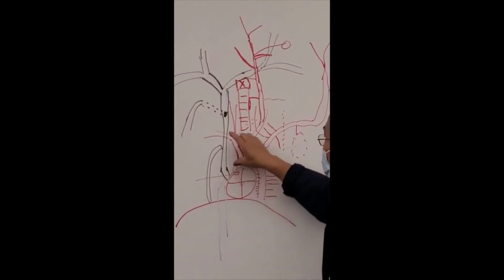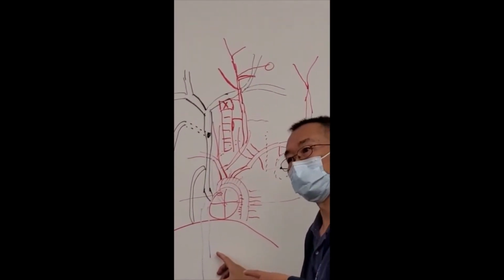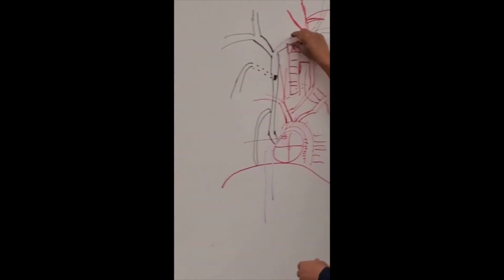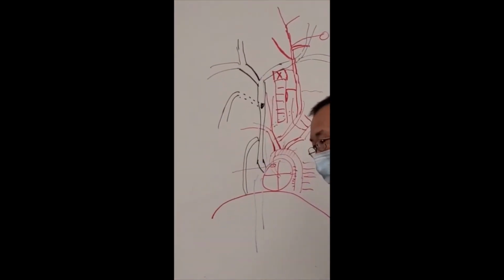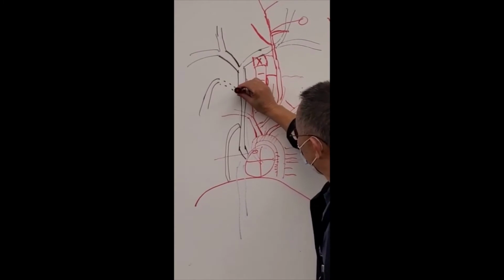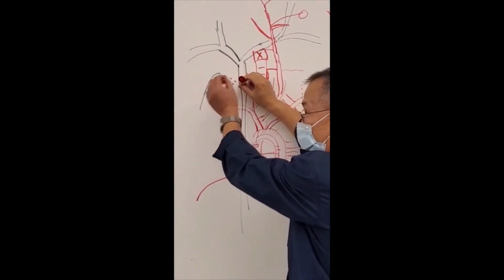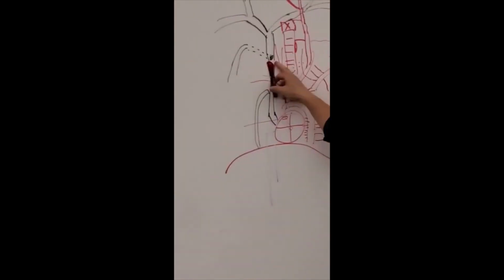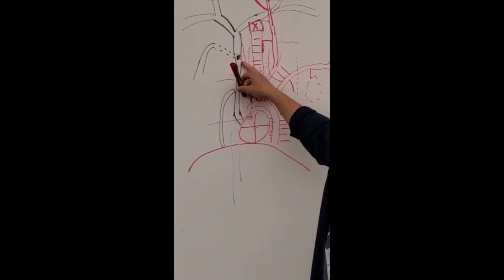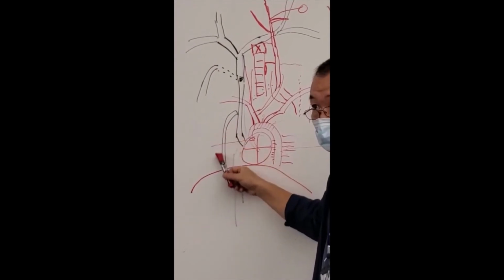Sure, you have superior vena cava, inferior vena cava. You never get a vena cava for the name of artery, right? That's only for the vein. You get a brachiocephalic. Okay, left and right. Okay, you get sternum. Sternum is sticking out like this. Sternum get a branch, internal mammary vein. Okay, so sternum you don't get an artery called sternum. That's only for the vein. Okay, you get azygos. That's the only.